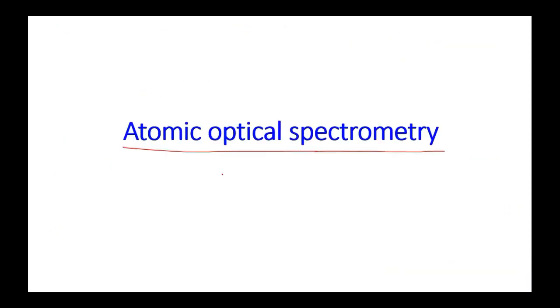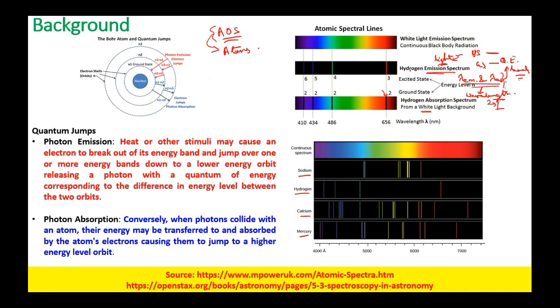This is because if you go back to our first slide, what we have said is that the quantum energy levels in both the cases are the same. We have also discussed that the absorption will only take place when we are exciting the atom with light of the emission wavelength.